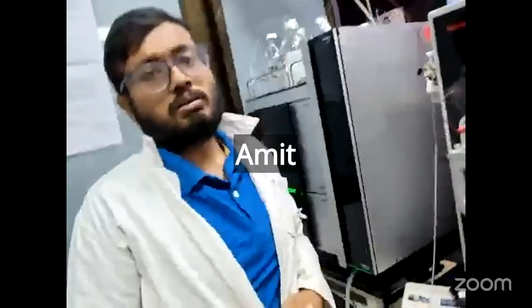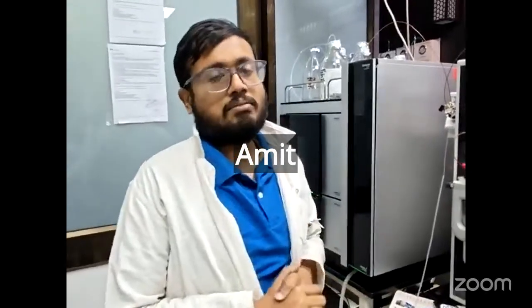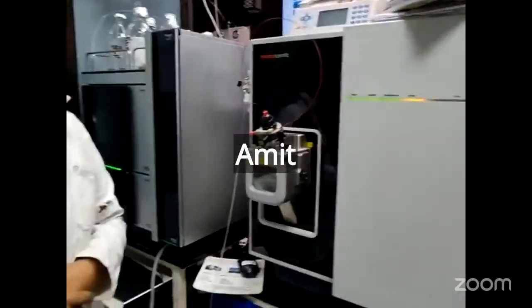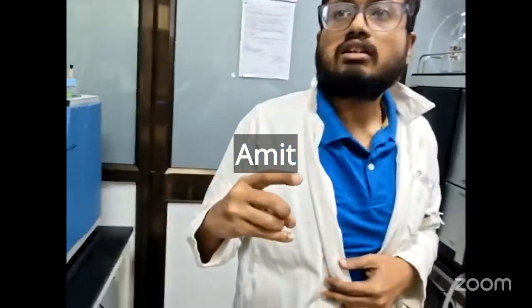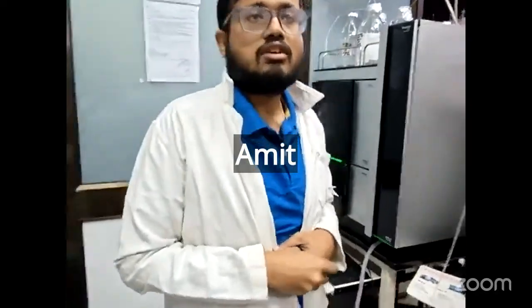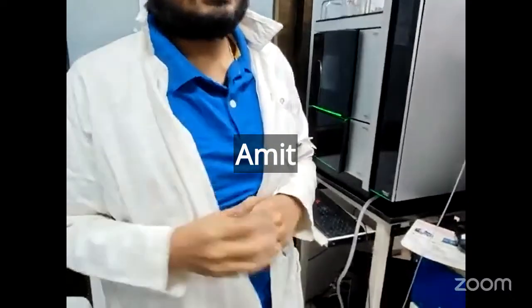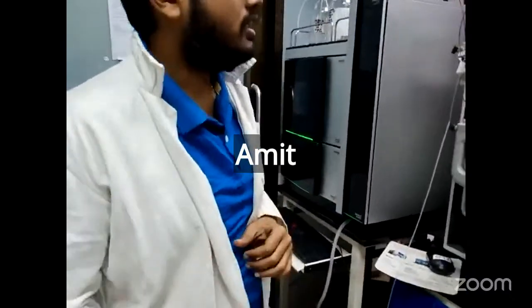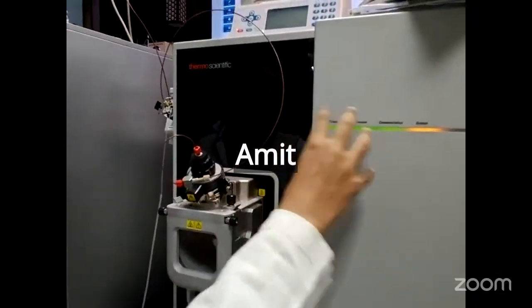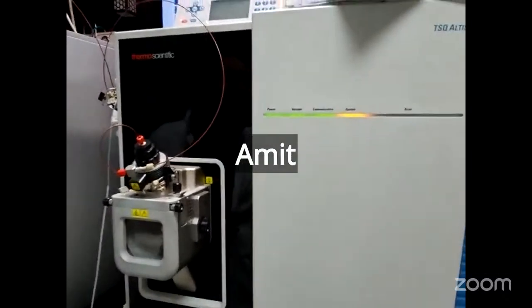So after showing you the two mass spectrometers, which use two mass analyzers in a hybrid configuration like quadrupole and Orbitrap, now I'm going to show you one example, which Sarah has already shown: the targeted validation on a triple quadrupole mass spectrometer, where it uses two quadrupoles. So here the configuration is a quadrupole followed by a collision cell chamber and followed by another quadrupole.